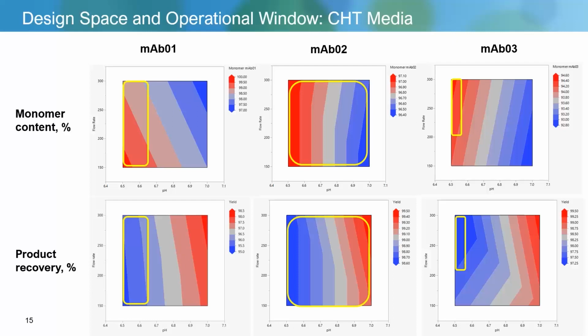These are response surface plots generated by DOE software. I would like to point out that for all 3 mAbs the responses showed very similar patterns. It's worth noting that numbers on scales are different. These results correspond to the entire peak eluted in the salt gradient. Without any collection criteria adjustment, what would happen in the next optimization round?